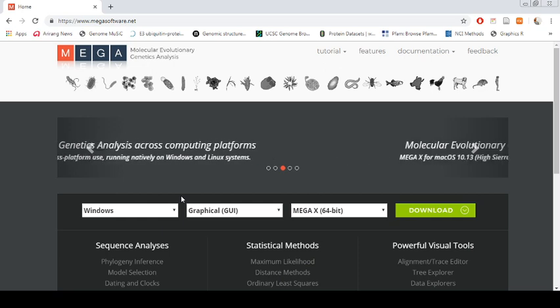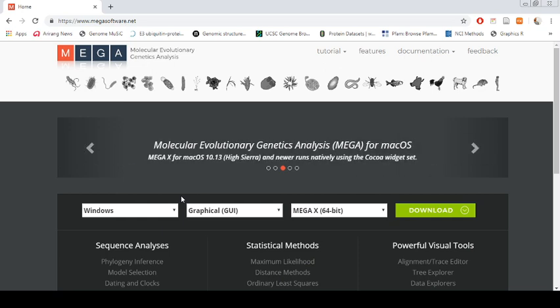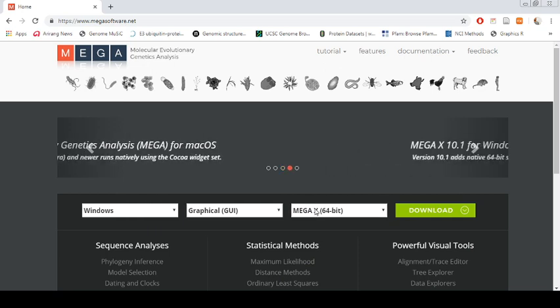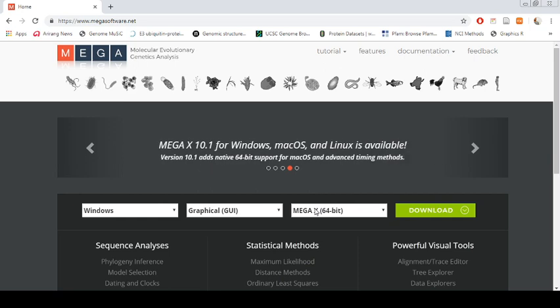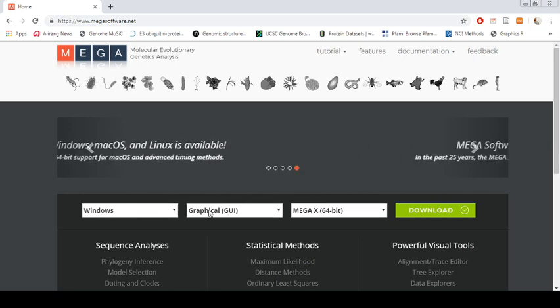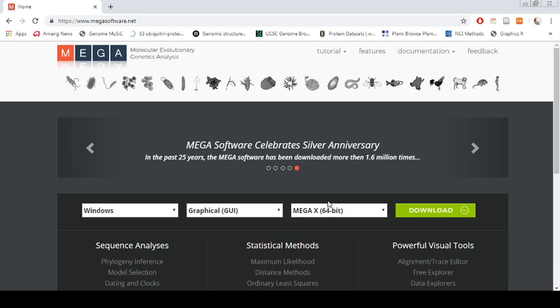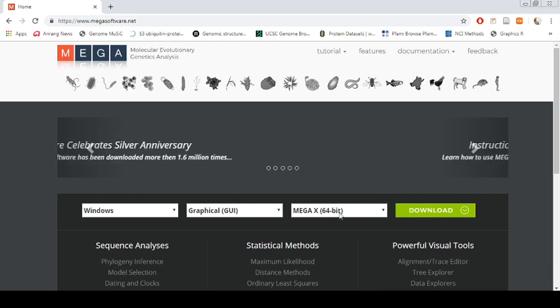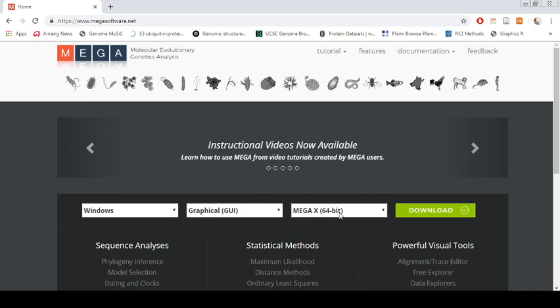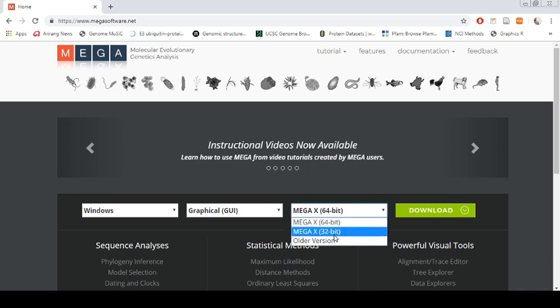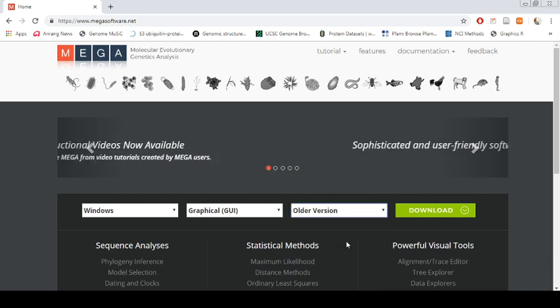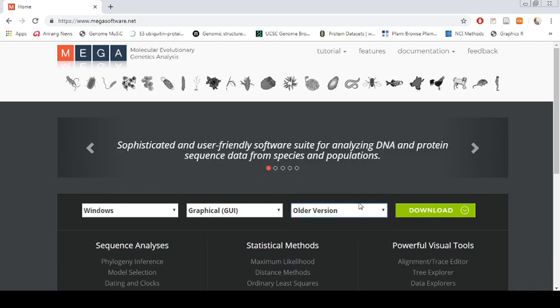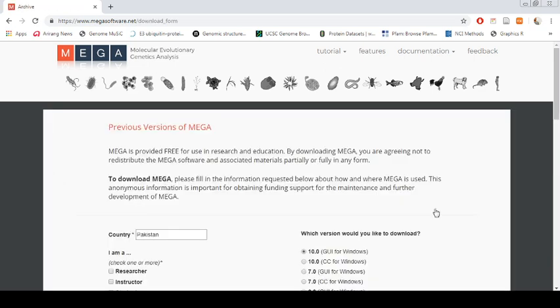Always try to download the second last or third last version because the latest version may have some issues. It is a very stable website. Here for Windows, I am using Windows and graphical user interface. MEGA X is the latest version, so we just go for older version. Just click the older version and it will take you to the next page where you have a lot of options.